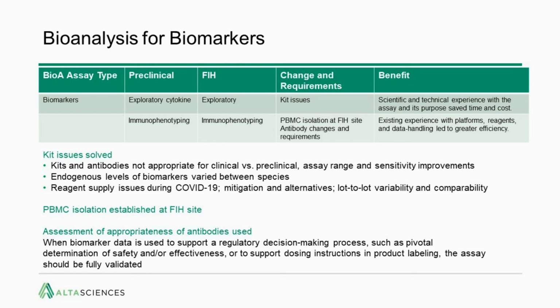And I'd like to just say a few more words about the biomarkers. Although I've emphasized the exploratory biomarkers, certainly there was a whole panel of additional biomarkers that were included, and there were multiple discussions with the client to understand the appropriate regulations that would need to be applied, whether they were exploratory or confirmatory biomarkers. Ultimately, when biomarker data is used to support a regulatory decision-making process, such as pivotal determination of safety and/or effectiveness, or to support dosing instructions and product labeling, the assay should be fully validated.